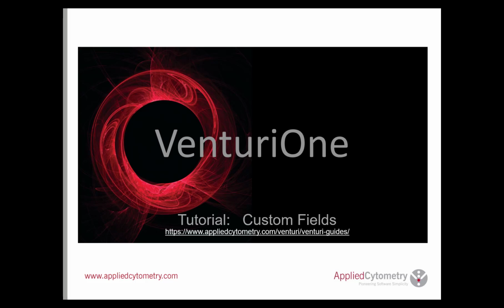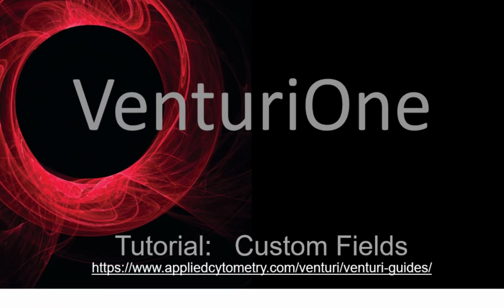Welcome to the Applied Cytometry Flow Cytometry software, VenturiOne. We've recorded some tutorials to help you get started using the software. To get the most out of the software, the tutorials are designed to be used alongside the Getting Started guide and the operation manual. You will find these at the website below.